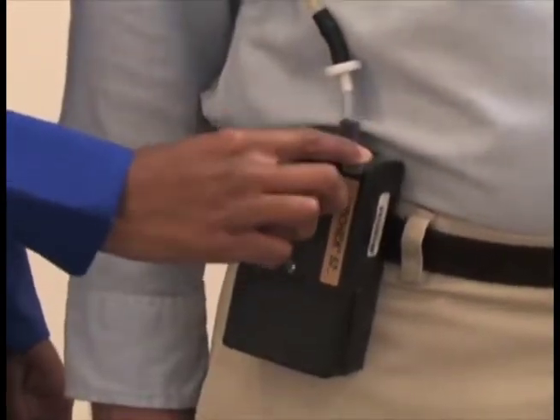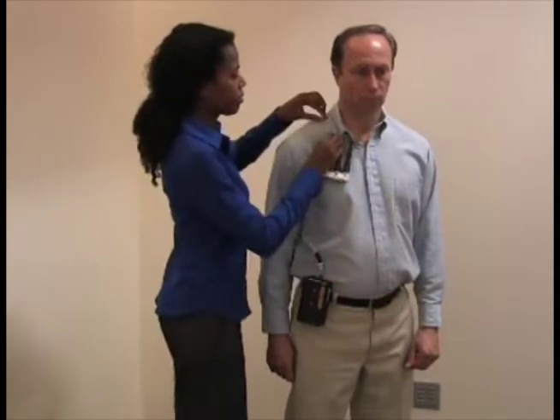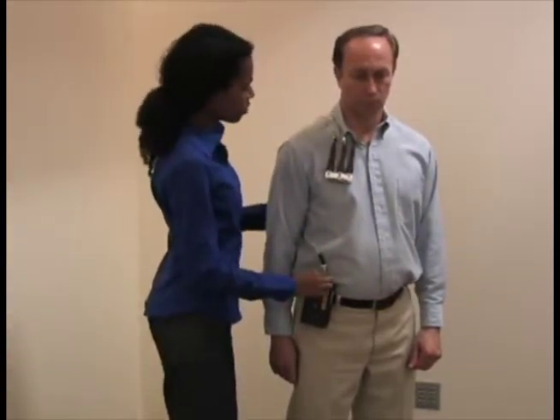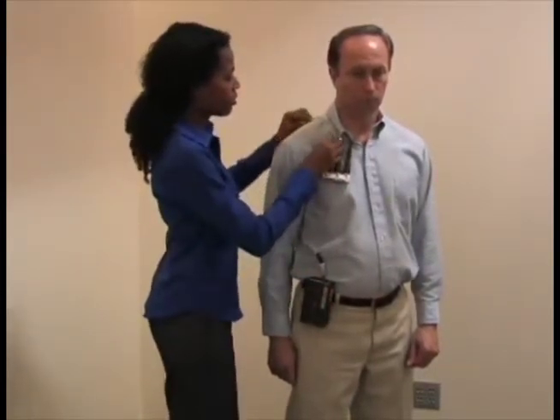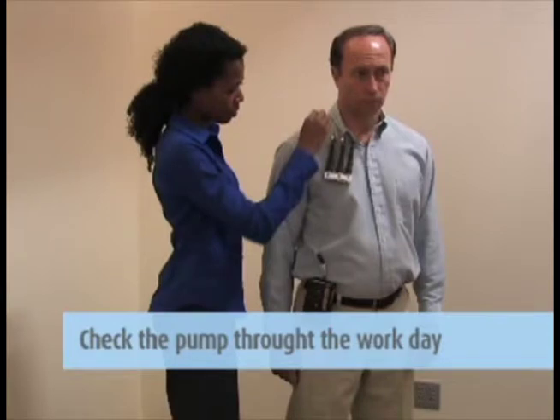Turn on the pump and record the starting time to the minute. The counter records the minutes the pump is operating and should read zero when you start the test. Observe the pump operation for a short time after starting to make sure it is operating correctly. Check to ensure the hose connection is screwed tightly to eliminate leaks.